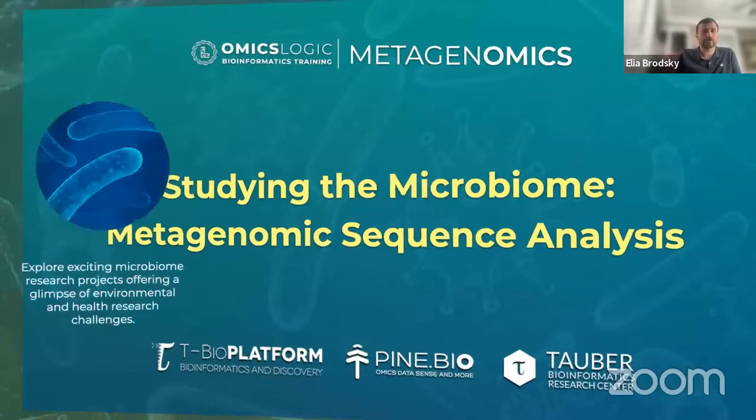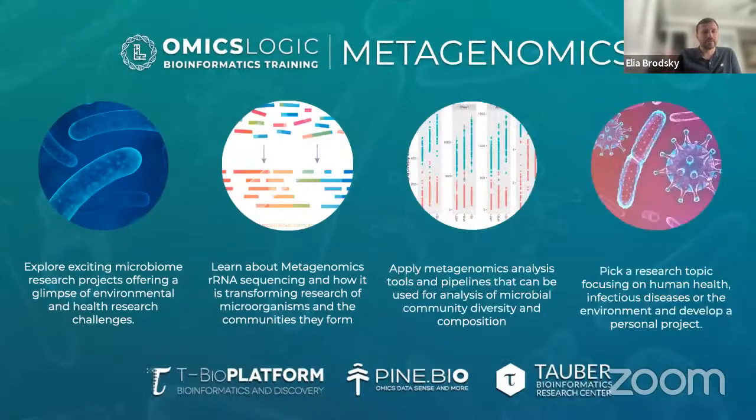So the program is really designed to introduce different types of case studies that illustrate the way the field of metagenomics has been evolving. What are some of the practical tools and skills that you have to be able to analyze this data independently? And also, what are some practical tips, tutorials, and maybe skills that you should have to be able to integrate this quantity of information from different databases, from the reads in the FASTQ files, and also the different metadata that you have about your samples to produce plots that help you interpret the data biologically.